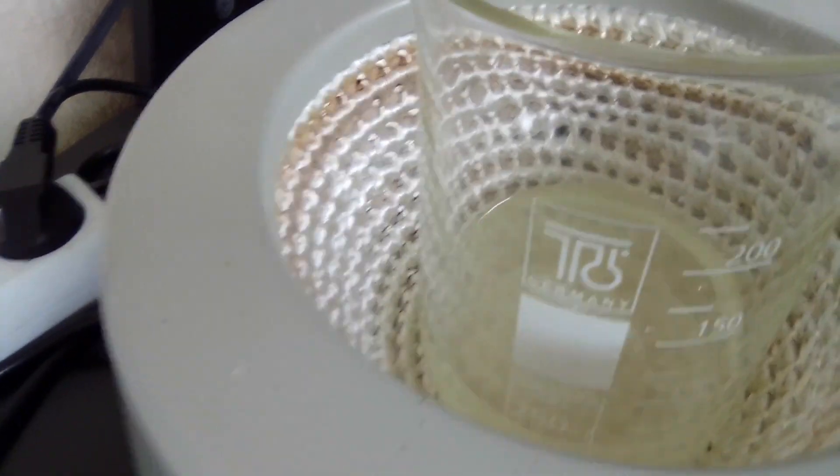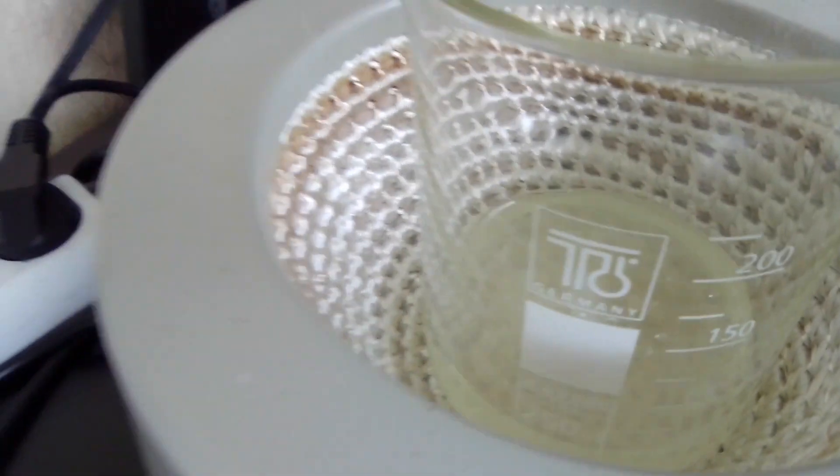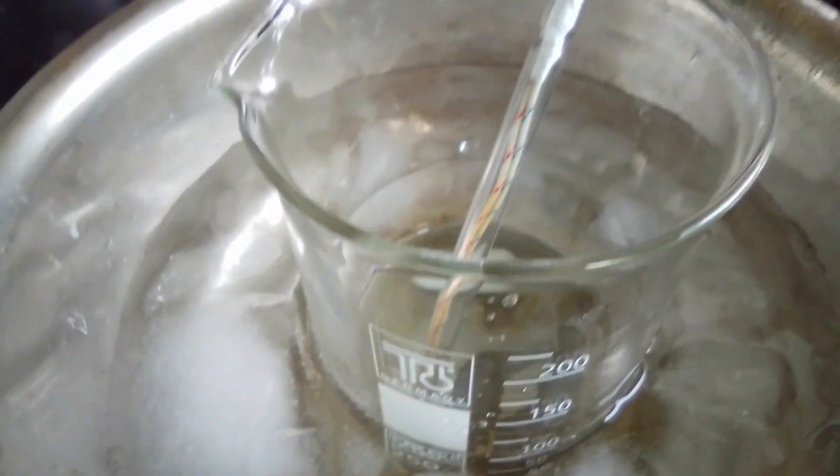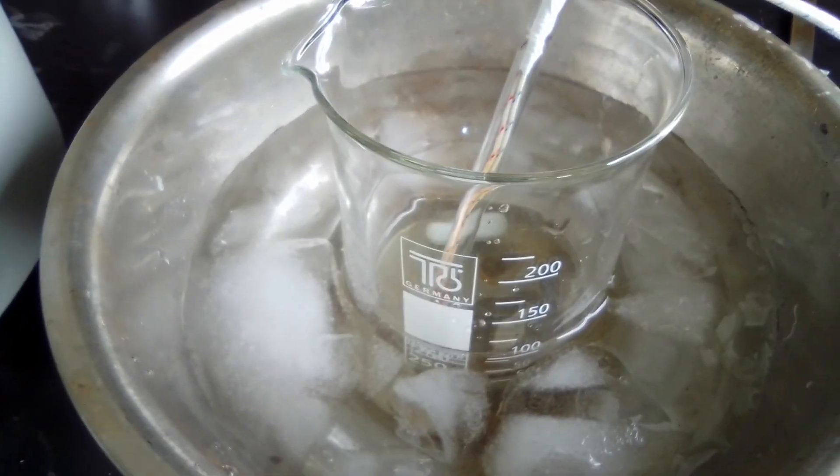I have added all the sodium nitrite and now we're going to cool it for about 10 minutes in an ice bath. We are cooling it until it reaches about 10 degrees Celsius.